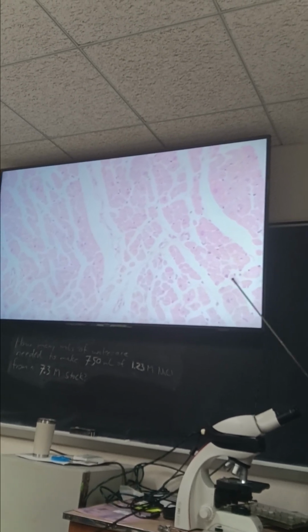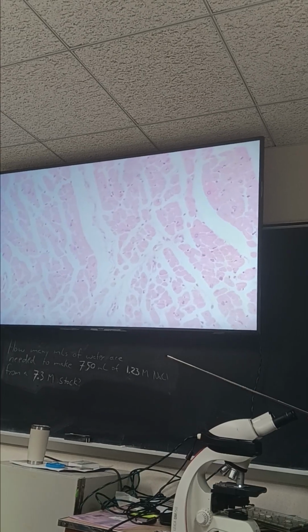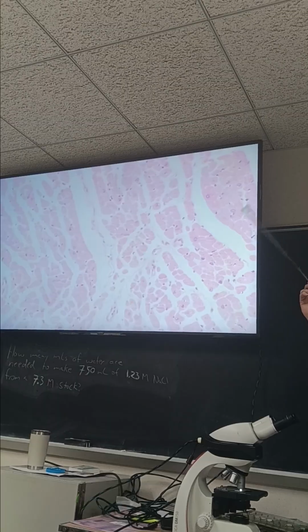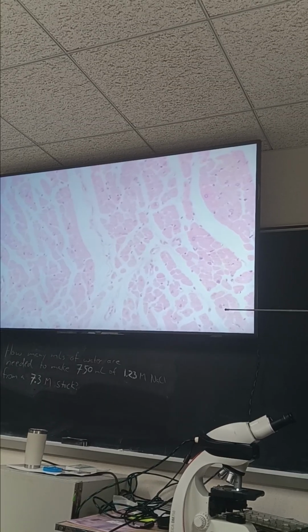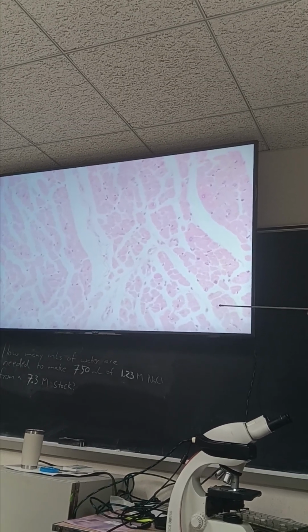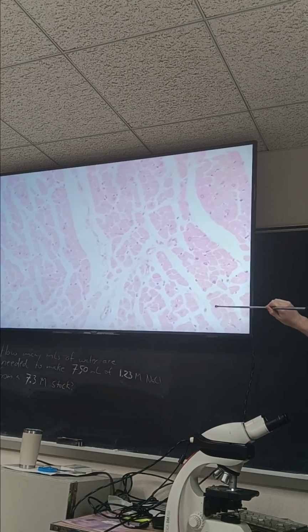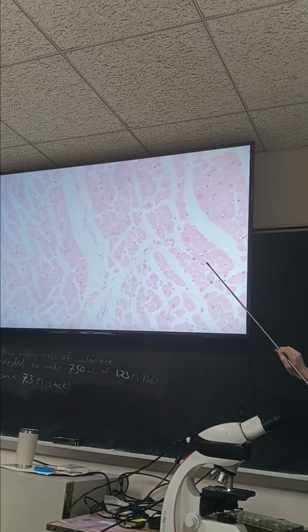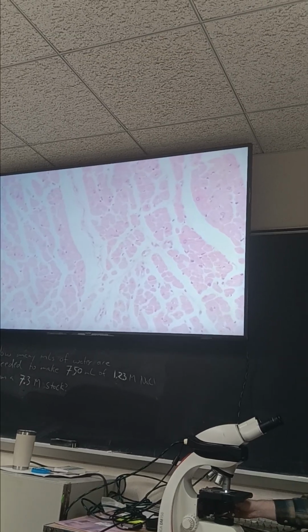If you dig deep back to anatomy, you learn about muscle fascicles, which is a skeletal muscle thing. I thought these were fascicles in cross section coming in and out of the screen. They're not, and one of the ways I can tell now even more is because again, there's that nucleus right in the middle of this big cell, just stuck in the middle of it. So I wasn't down far enough, so I've got to go further.